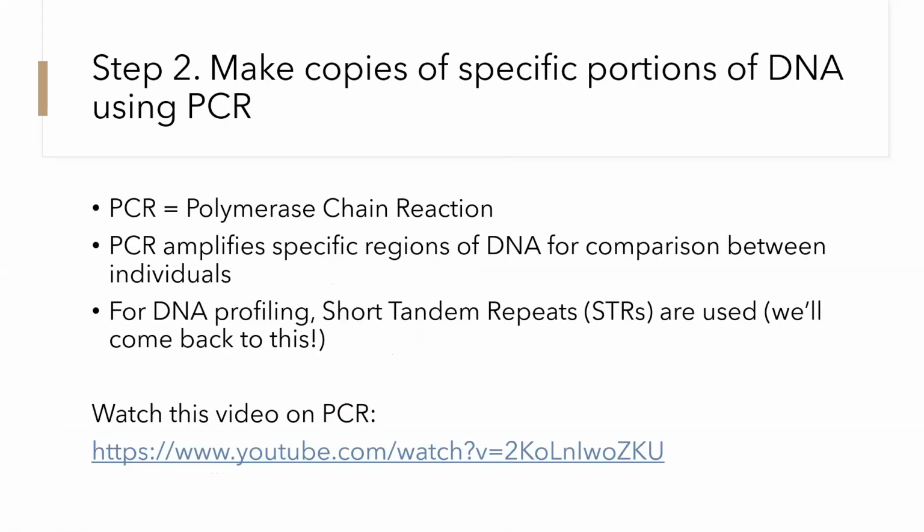Okay, so step 2 was to make copies of your specific portions of DNA using PCR. We're not trying to make a copy of all of the DNA, we're just trying to make a copy of the portion that we're interested in, that target gene. PCR stands for polymerase chain reaction. This is one of my favorite molecular techniques, mostly because it's really gratifying to do. It usually works when you do it. And also it's kind of hilariously used in crime scene TV shows.